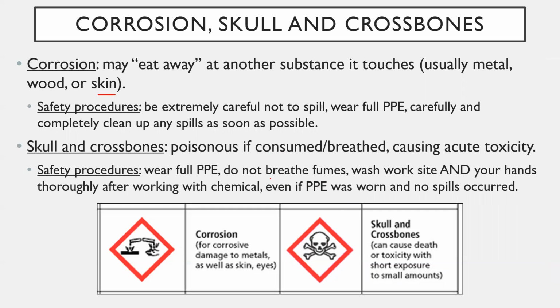In our courses, when we say don't breathe the fumes, we literally just mean don't lean over it and smell it, right? If you smell it, that could cause some serious issues with you too. But working at it at arm's length is totally fine.